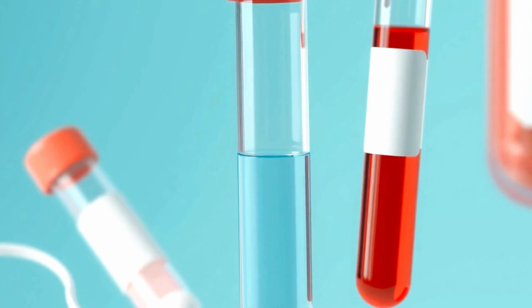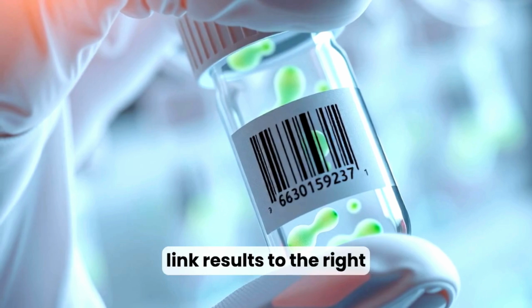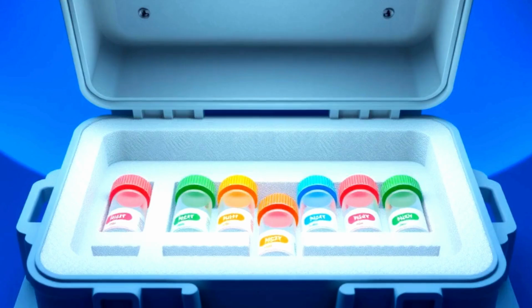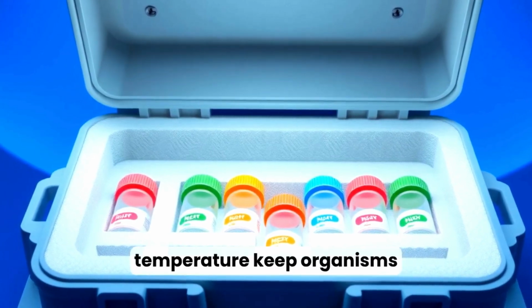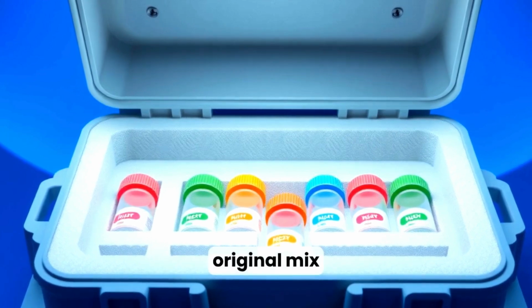depending on symptoms. Accurate labeling and documentation are critical to link results to the right patient and maintain chain of custody for reliable decisions. Transport conditions matter. The correct medium and temperature keep organisms alive without overgrowth or death, preserving the sample's original mix.